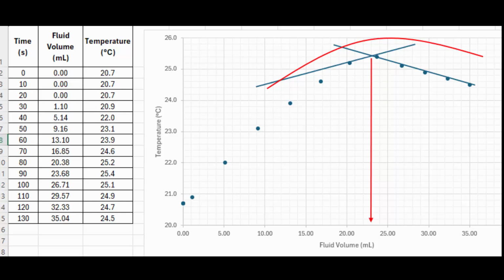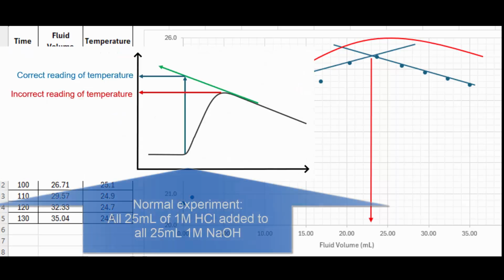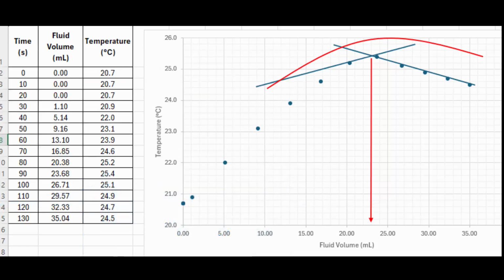It's a little bit like a mix between a Job's plot and a standard enthalpy experiment, where you just dump it all in there and then see it rise up, because it's popping up in exams. So you kind of have to know what they're doing. Okay.